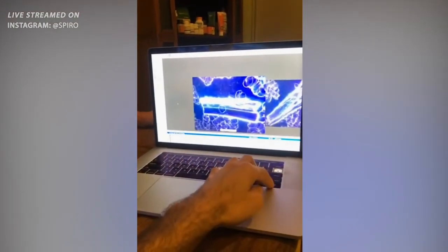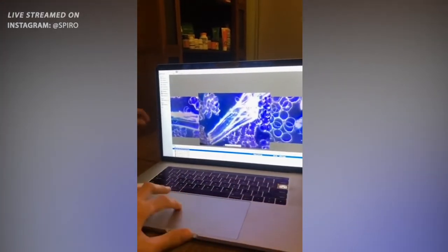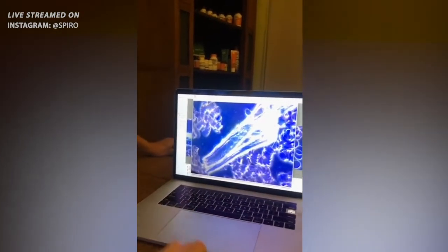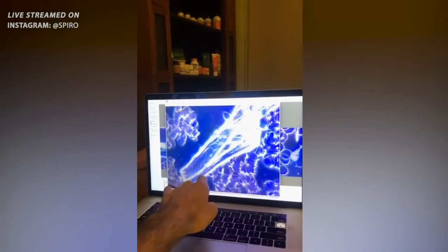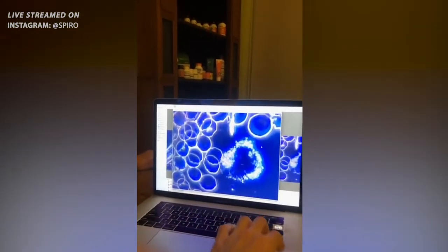Okay, so is that a new one? Did we take a look at that one? Yeah, this we haven't seen. Let's enlarge that. All right. So is this the same one or different? Again, that's unknown. We don't know what that is. Yes, definitely nothing organic.